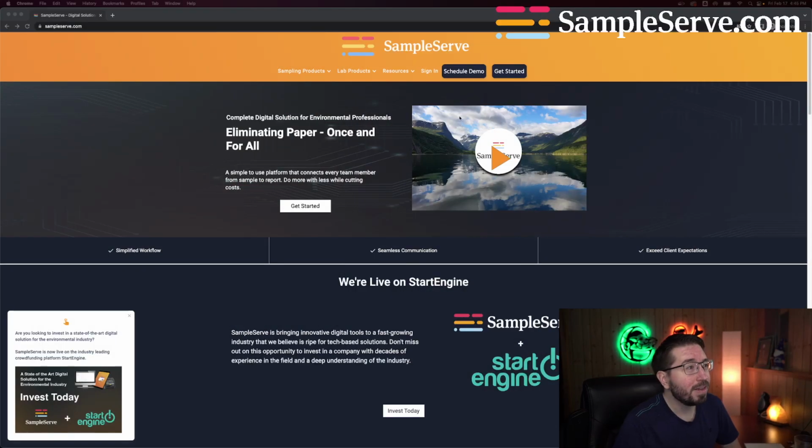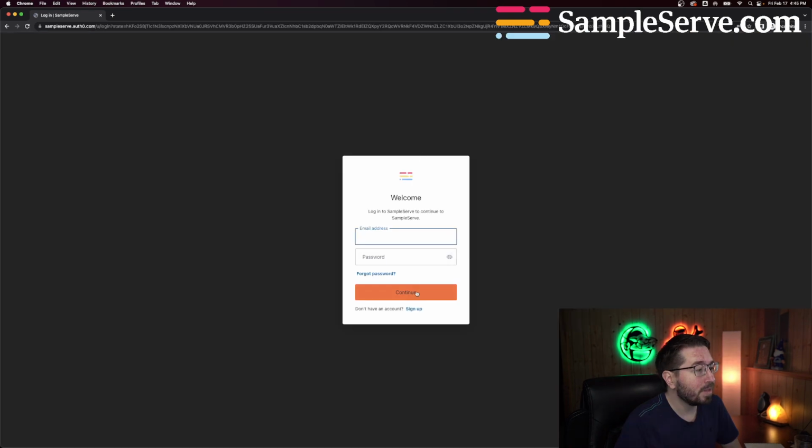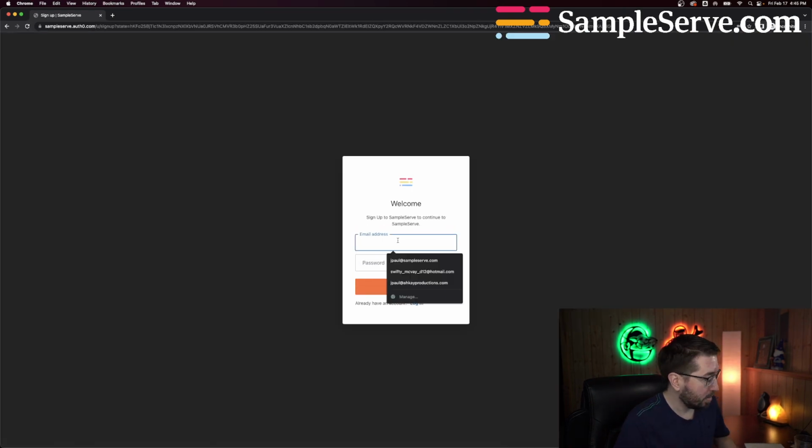I'm going to show you how to go from starting an account on SampleServe.com to getting analytical data tables. So let's get right into it. Here at SampleServe.com, we're going to go to Sign In. We're going to sign up for a new account at the bottom here. Here, I'm going to create a new account.